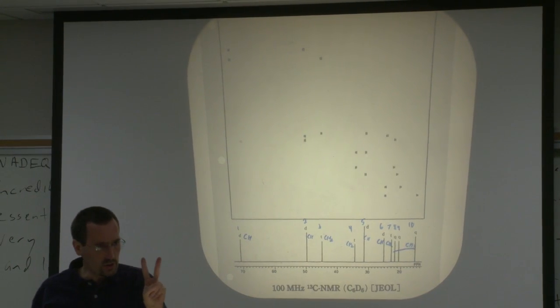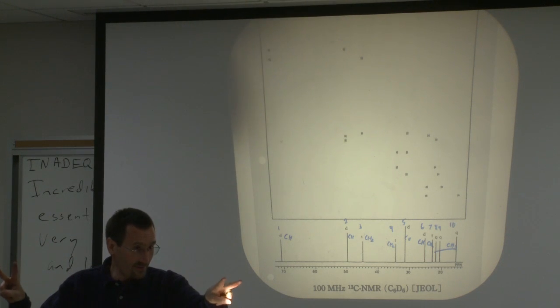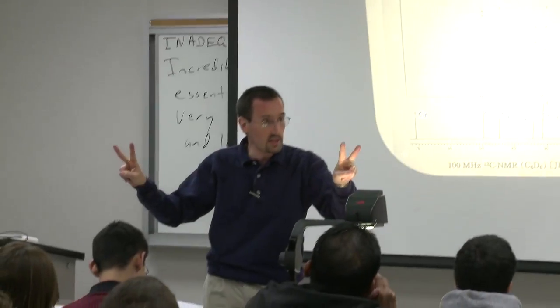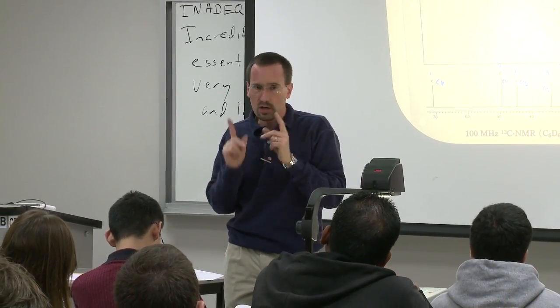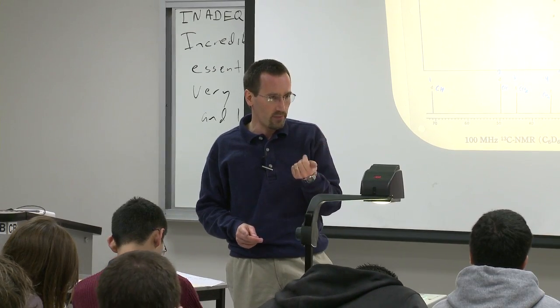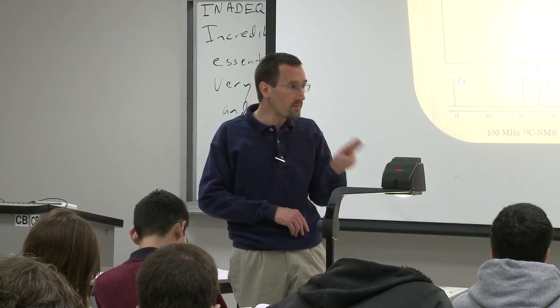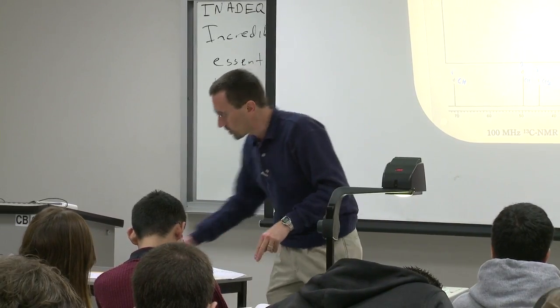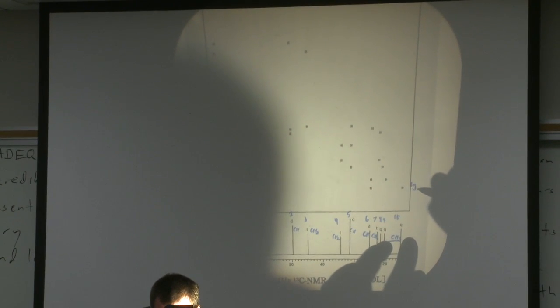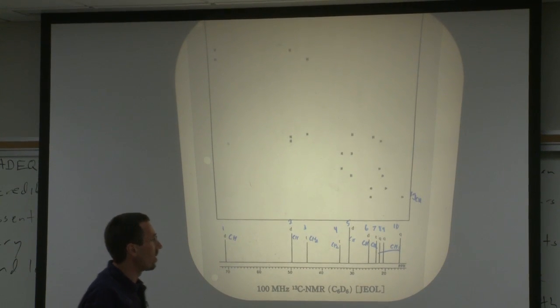What are those 2 little lines? A doublet, from the carbon-carbon splitting. Yeah, so you're seeing the carbon-carbon splitting. Remember, carbon has a much smaller magnetogyric ratio than protons, so the carbon-carbon coupling constant is going to be smaller than a typical carbon-proton 1 bond coupling.